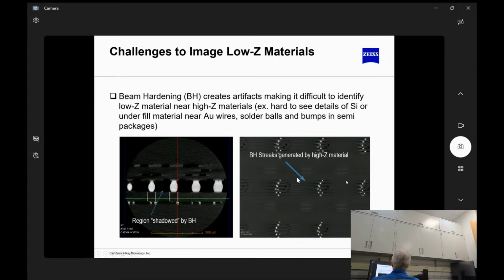These beam hardening streaks in microelectronics are terrible, but there's not much of a way that we can get around it at one angle. If we scan at a couple different angles through my sample, then I can recombine those volumes in 3D space and take maximums, for example, and then minimize those effects. Now, the effects at the edges, that's harder to do just by doing angles.